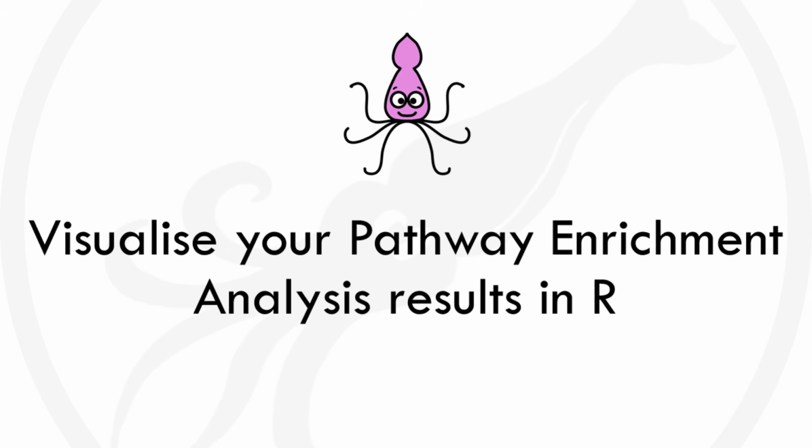Biostat Squid. In this video we will go through a step-by-step tutorial to visualize your pathway enrichment analysis results. We will explore different ways of plotting our gene sets and their genes after performing functional enrichment analysis with clusterProfiler.